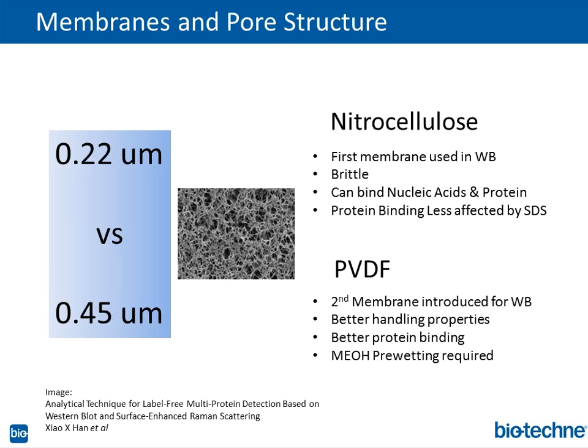I want to mention, too, that PVDF, if you're ever doing any kind of protein chemistry, PVDF was actually used a lot of the time in Edman degradation sequencing because it can tolerate all of those organics. They used to do Edman degradation sequencing right on the membrane, and it's also compatible with Coomassie blue stains because of the high methanol.